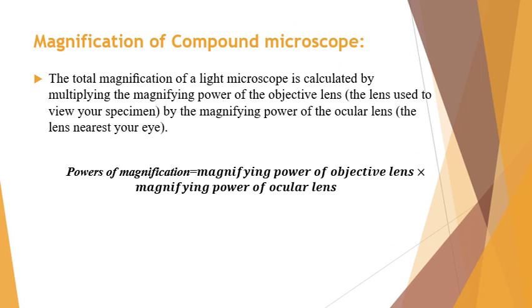Now here we have some technical terms that are related to a microscope. Here we have magnification. Magnification is the enlargement of a specimen. We can say that compound microscopes have up to 6 interchangeable objective lenses that have different powers of magnification or power of enlargement.